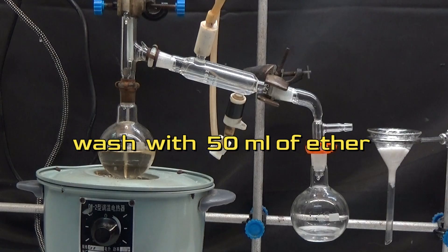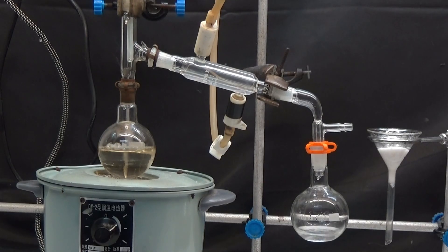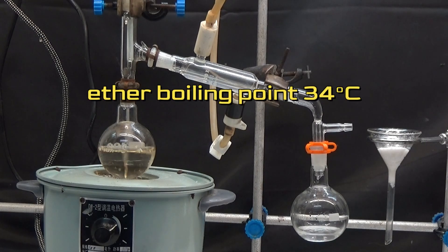The filtered product is distilled. First, the ether is distilled at 34 degrees, and once the ether is distilled, the vacuum is connected and the ester is distilled.